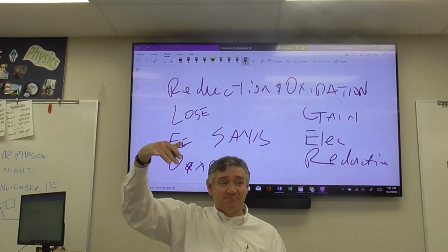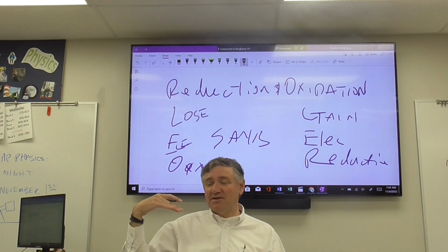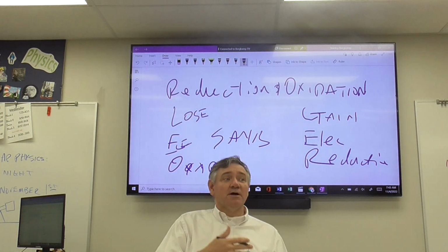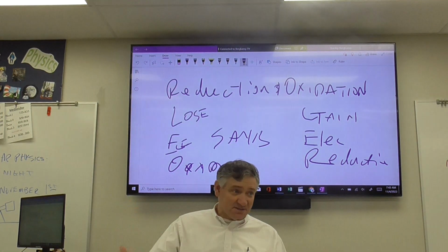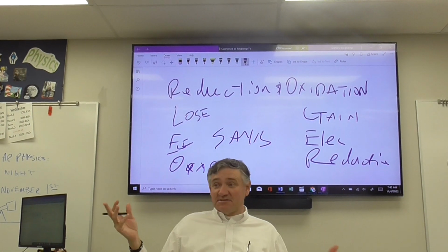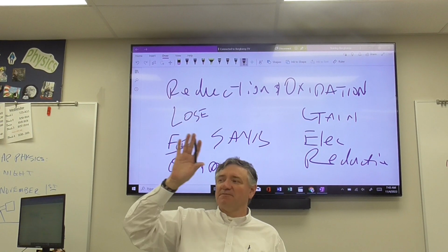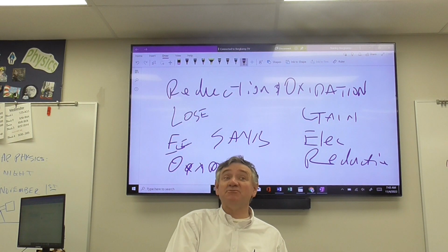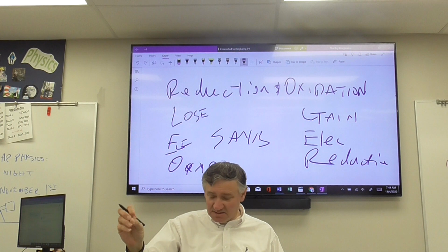I'm saying this because I can't tell you how many pairs of pants and shirts I've ruined over the years. You get one drop on it, especially concentrated acid or concentrated base, and you don't know it until you wash it, and then there's a hole in your pants or in your shirt where you got something on it. It isn't like a drop of acid on your clothes is immediately going to start to smoke. But if you're worried about your clothes, put that on. And I will have zero, zip, no tolerance for someone not wearing their safety glasses today, because you're dealing with such caustic chemicals.